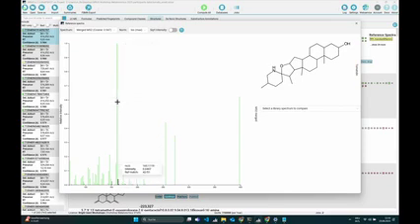But what you have here is all your MS2 peaks, and now you don't only have blue-colored peaks. Blue-colored means that you have a fragment in your fragmentation tree which can explain this peak. But now, because we did our combinatorial fragmentation of this particular structure hit, so this is something extra. This is not something that we always do, but this is only for your validation. And if we now click on such a peak, we can see that the substructure which matches this peak, so this is now not a subformula but a substructure, is highlighted in this window.